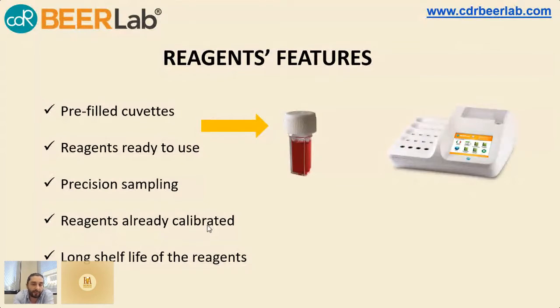About the shelf life of the reagents, normally we have 1 year of shelf life. Next.